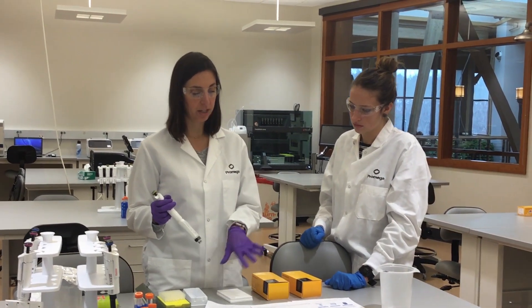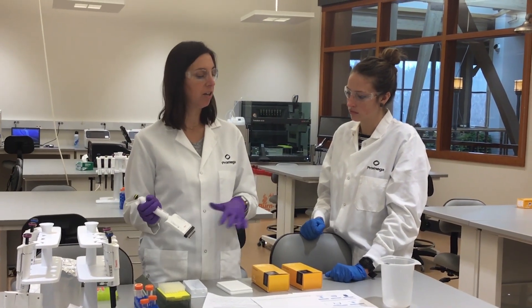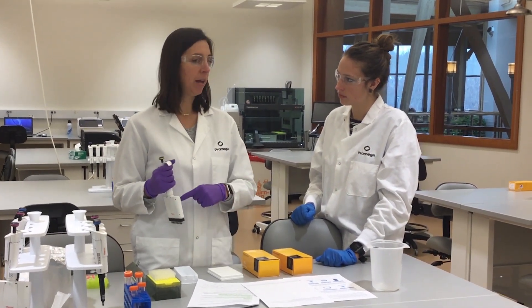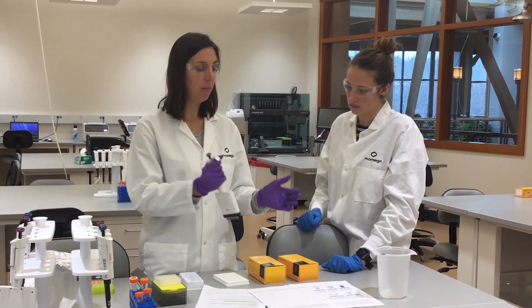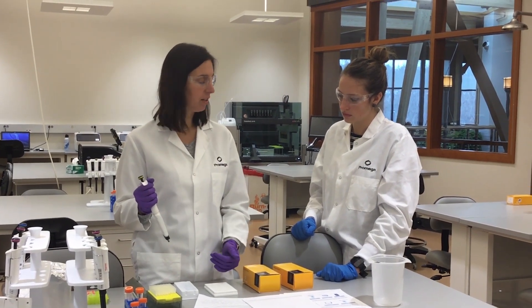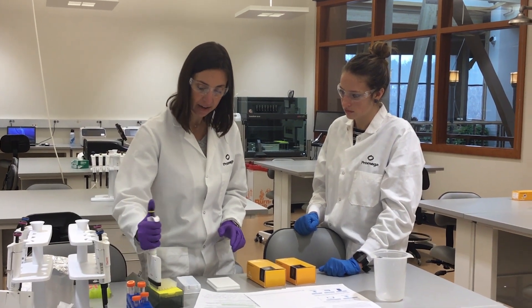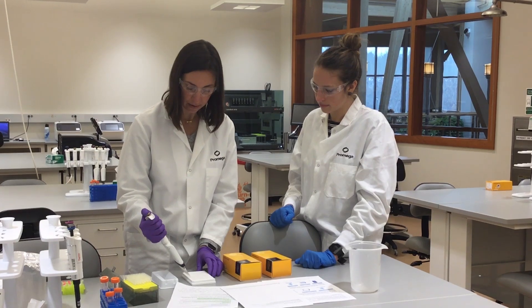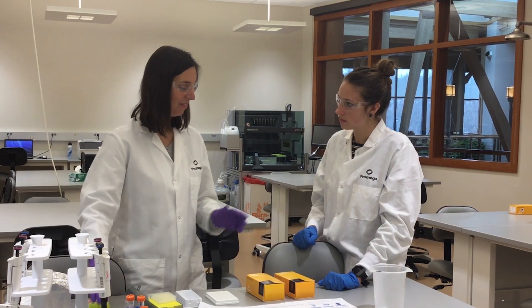First, what you're going to want to do is make a cell suspension. If you have suspension cells, they're already in suspension. If they're adherent, you're going to trypsinize and make your cell suspension. Then you're going to plate it out. I'd recommend plating some in a six-well plate that you can continue to propagate, and then make a replicate plate in a 96-well plate like we did here. Once your cells are plated, all you do is take your HiBiT detection reagent, add it to the cells, let it incubate for a little bit, and go read it on the plate reader.